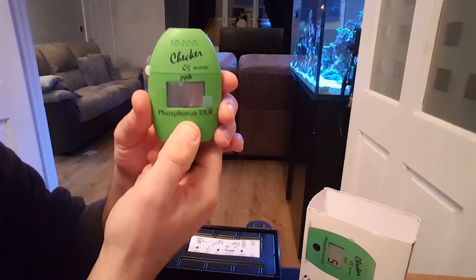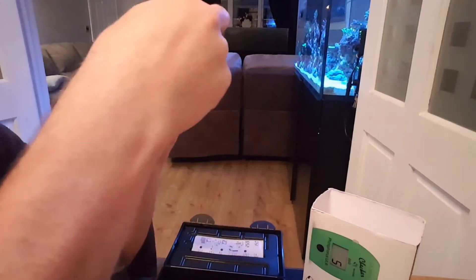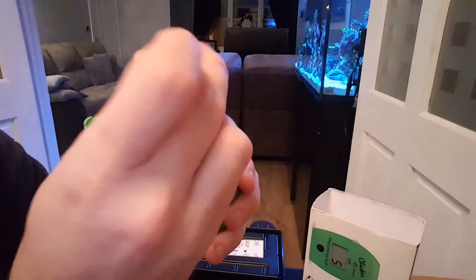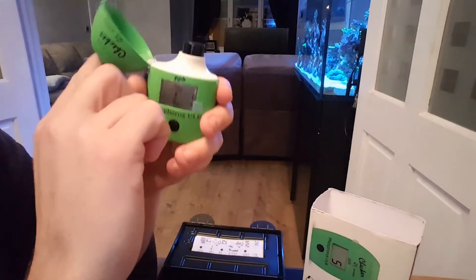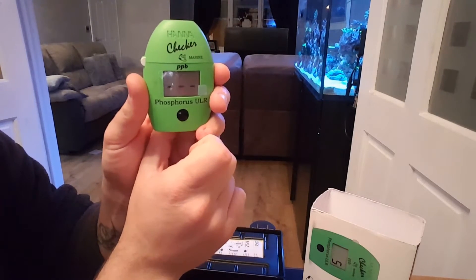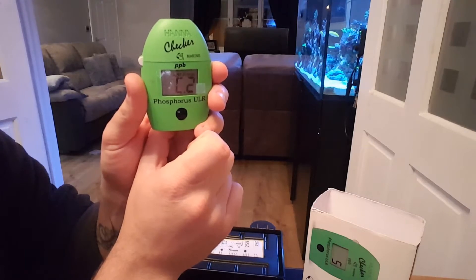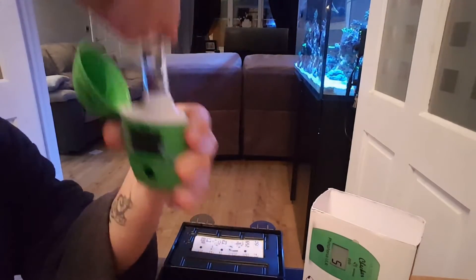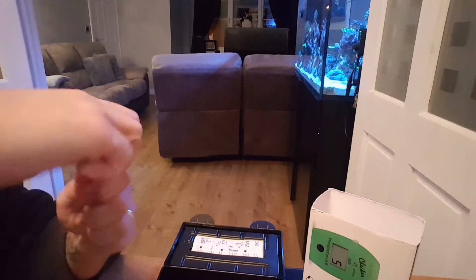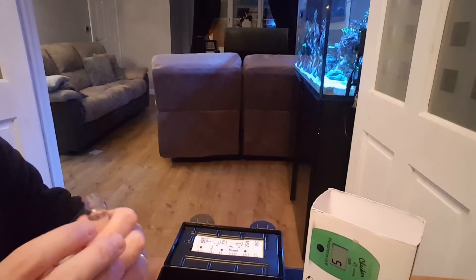Press the meter once. You'll see C1 come up. When C1 comes up, put your vial in, shut the lid, and press the button once. When it says C2, take the vial out, open it, and add your reagent.